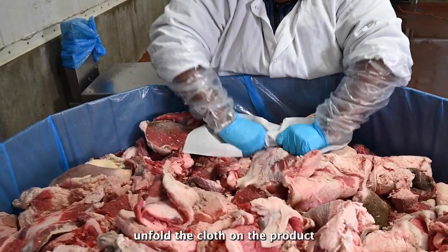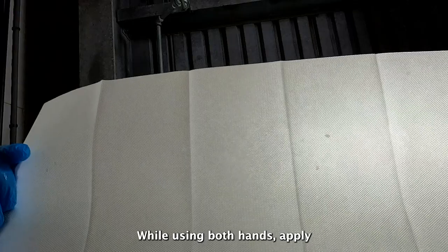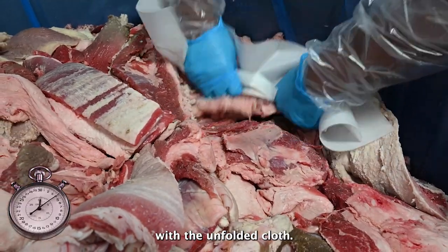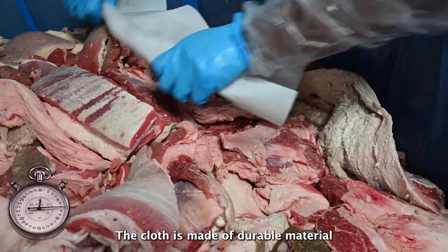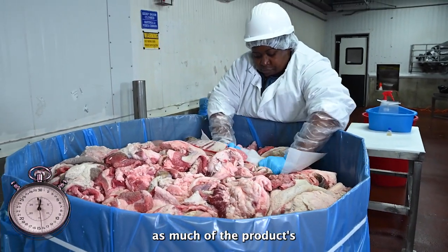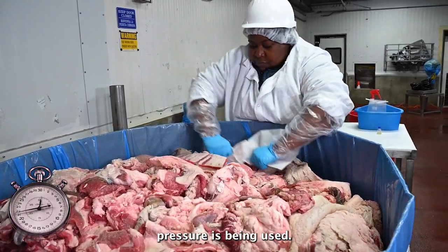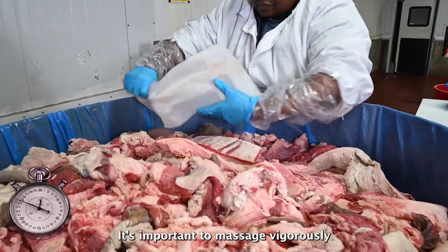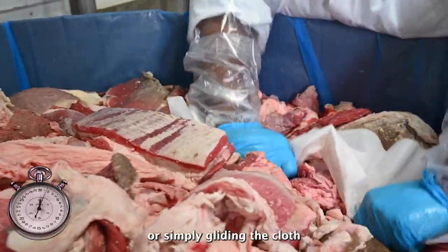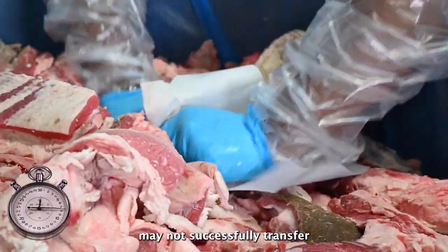Once you have determined your starting point, unfold the cloth on the product and tightly grasp the cloth with both hands. While using both hands, apply downward pressure to vigorously massage and scrub the surface of the product with the unfolded cloth. The cloth is made of durable material and is unlikely to tear. Make sure to reach into the spaces and crevices between meat pieces to sample as much of the product's surface area as possible. You may have to re-grip the cloth to ensure enough pressure is being used. It's important to massage vigorously so that any bacteria, if present, will be transferred to the surface of the cloth. Non-vigorous massage or simply gliding the cloth across the surface of the meat in a shoeshine fashion may not successfully transfer bacteria to the cloth.